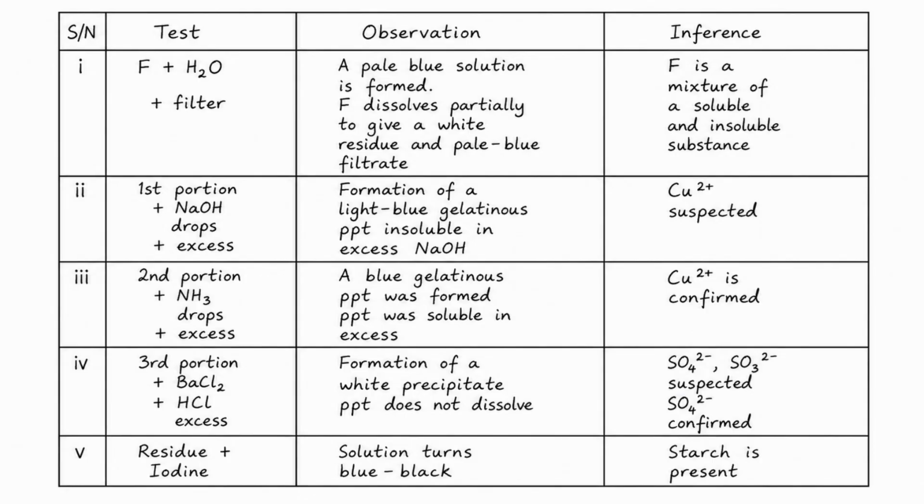Look at the summary of all the tests, a report of all the tests we've carried out so far. You can pause the video to understand it better.